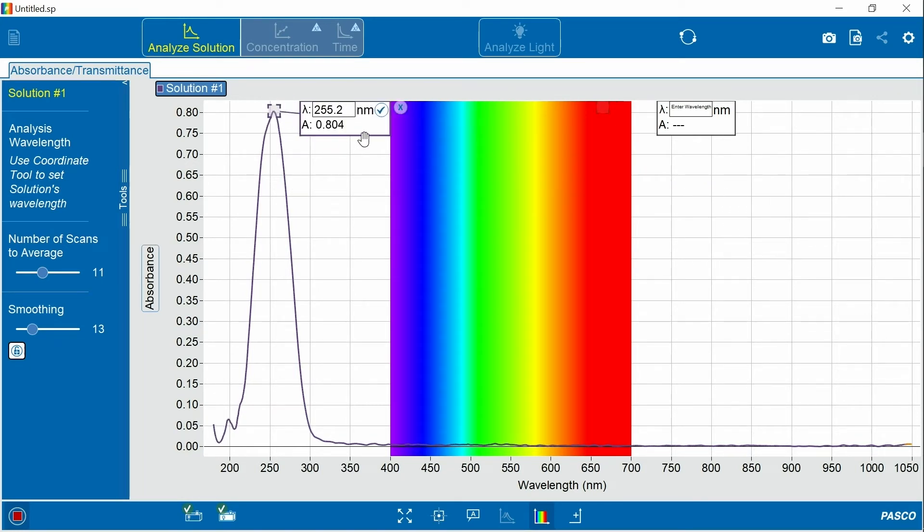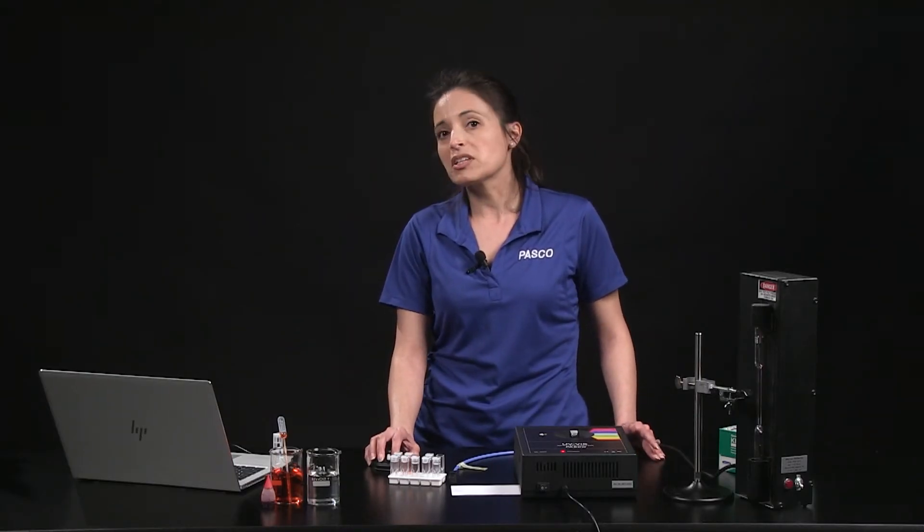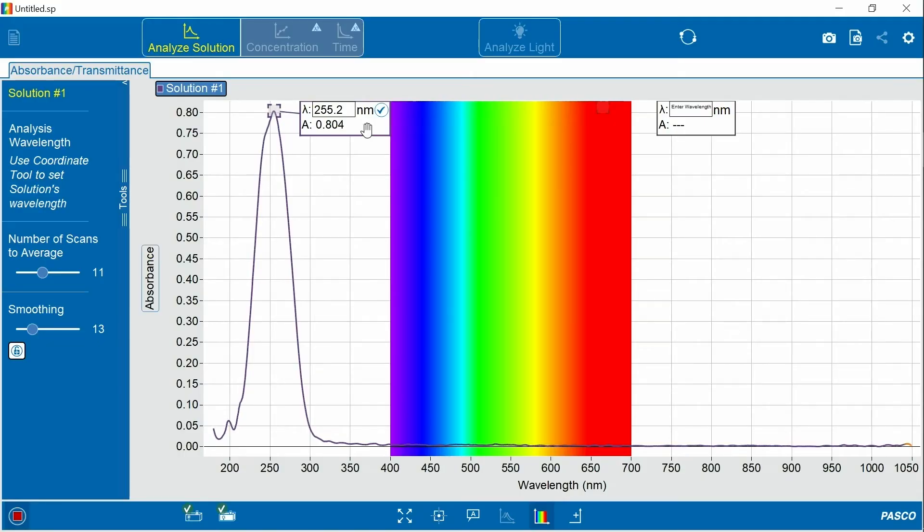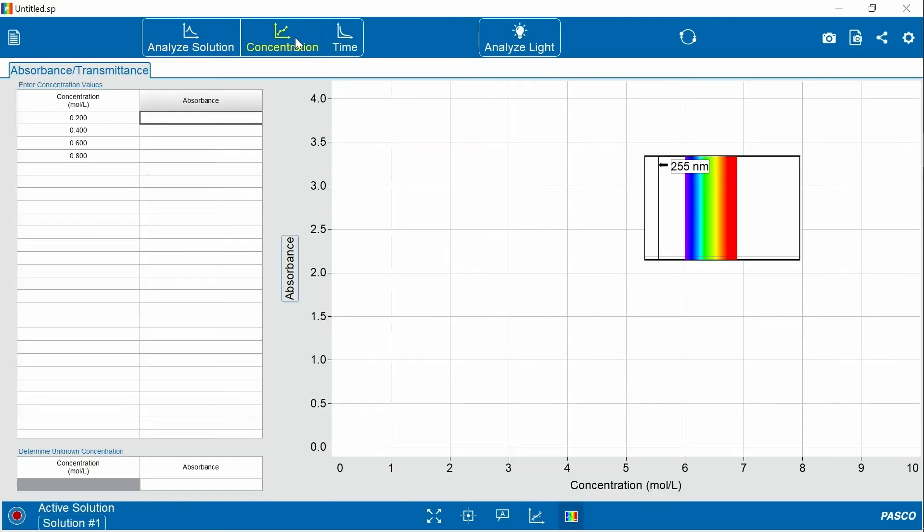And you'll want to keep your maximum absorbance below one. I've just shown you one way to look at solutions, but you can complete a Beer's Law analysis to determine the unknown concentration of the solution if you keep your selected peak, stop collecting data, and move to the concentration tab.